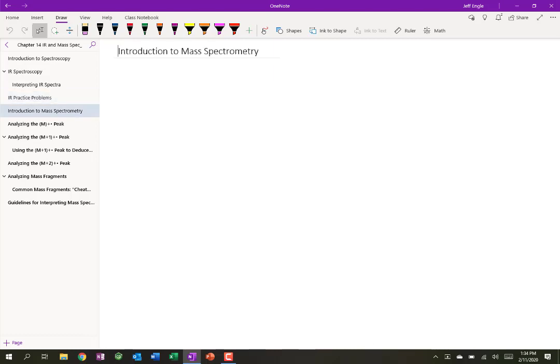So what we're going to do today is talk about something new. We're going to talk about mass spectrometry, which is kind of cool. Has anybody ever heard of mass spectrometry? A few people? All right, so it's often featured in a lot of the CSI shows. However, it's not as fancy as the CSI shows make it out to be. Oftentimes on CSI they'll say, oh, we've got the sample, we know that it was from, I don't know, a Ford pickup truck built in 1962, blah, blah. It's not that good, but it does give you a lot of information about a potential unknown compound.